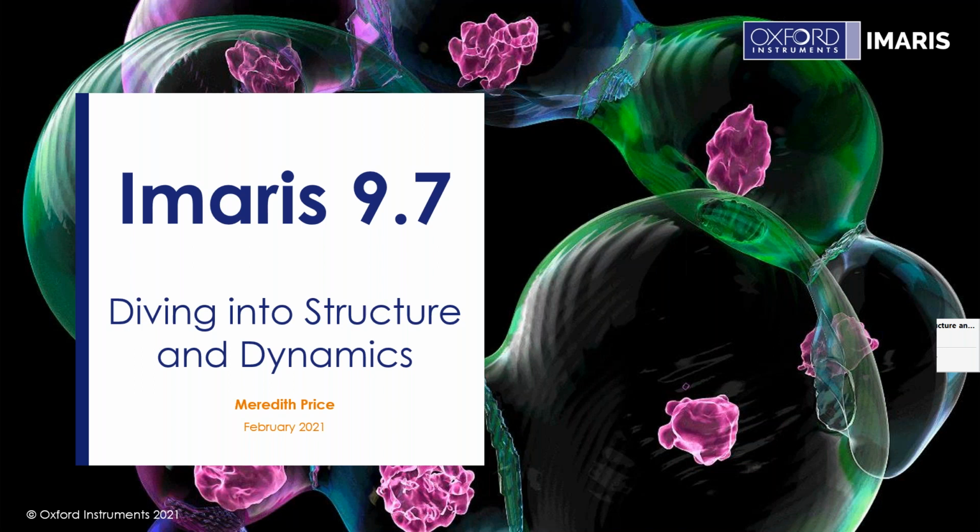Today, I'm going to tell you about our newest release, Imaris 9.7. I want to keep your attention, but at the same time, it is available online right now as well. For this release, we have focused on two separate stories, structure and dynamics. The idea for both of these stories is that we're going to help you get more out of the images that you have. So we're going to give you even more information to help you understand the structure in your 3D images and 4D images, as well as understand the dynamics that are happening in your time-lapse images.